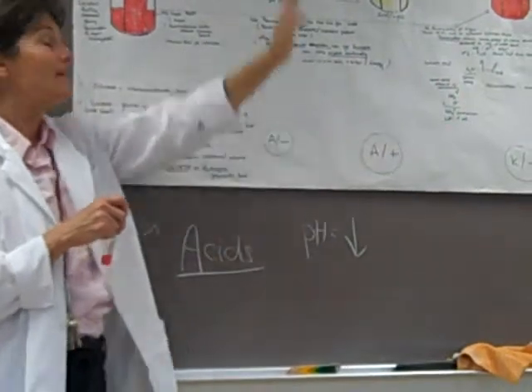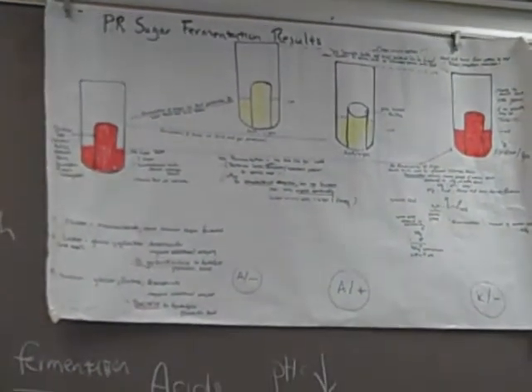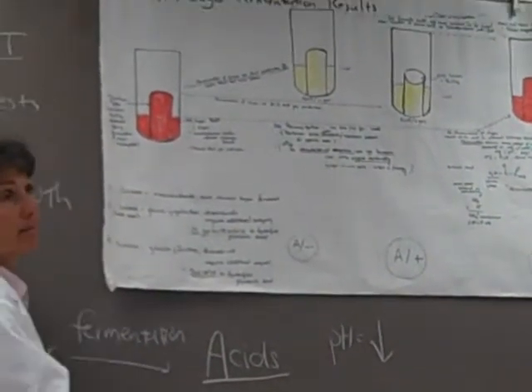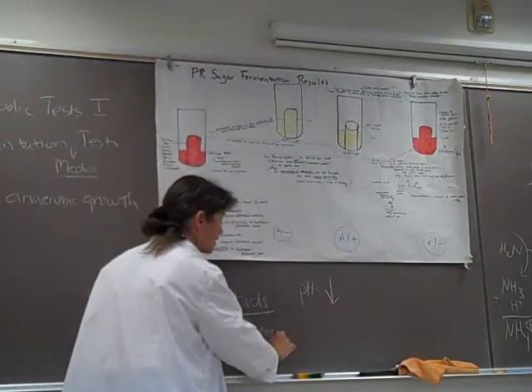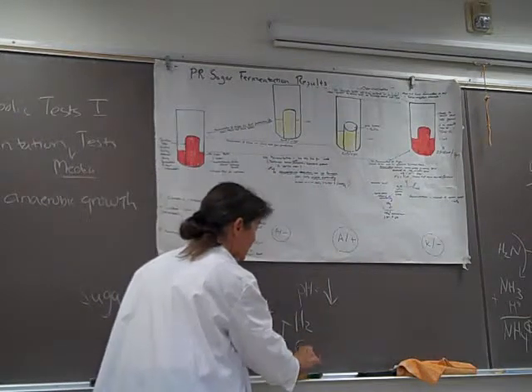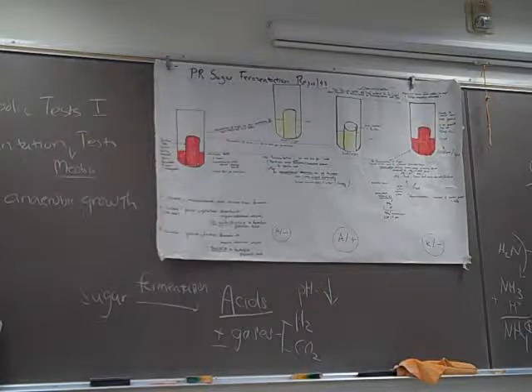Okay? Now, in addition, during fermentation, some microbes have additional enzymes that permit them to make, so I'll put plus or minus, some do, some don't, gases. And the gases are usually either molecular hydrogen and or carbon dioxide. And that too is important. It's important for us to detect whether gas is produced.